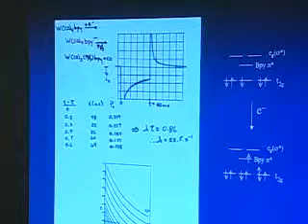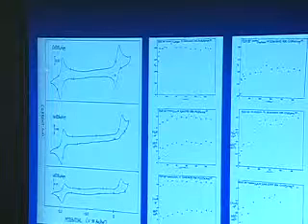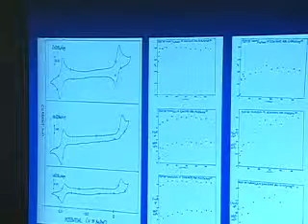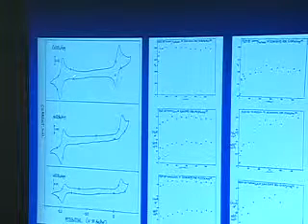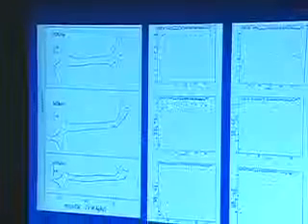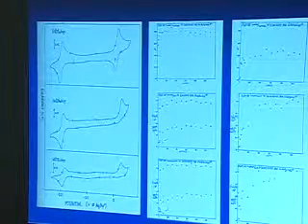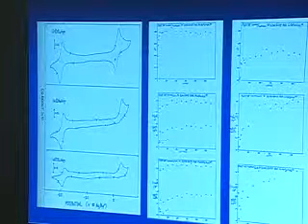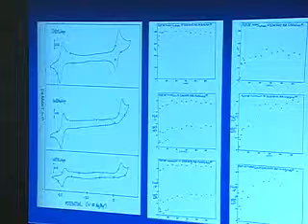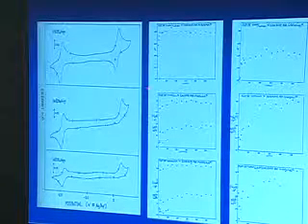We start over here, and we jump to this side of the wave. We make it a big enough jump that we have the Cottrell limiting current over there. And we were doing that not for the chromium system that I'm pointing to, but for the molybdenum system in that case. Okay. So at this particular scan rate, 100 millivolts per second, it looks reversible, but we're fooled. If we go fast enough, something else is going to happen. Over here, we're clearly non-reversible.